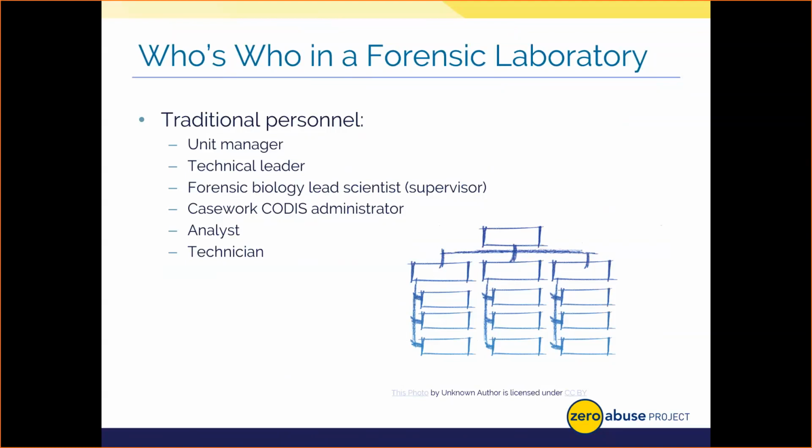And then finally, some labs, if they have the capability to hire them, have technicians that do a lot of the QC stuff. They do our reagent checks. They check our controls. They'll do some serology, but then they leave some of the work of interpretation of the DNA and the more difficult and nuanced processes to the analyst.